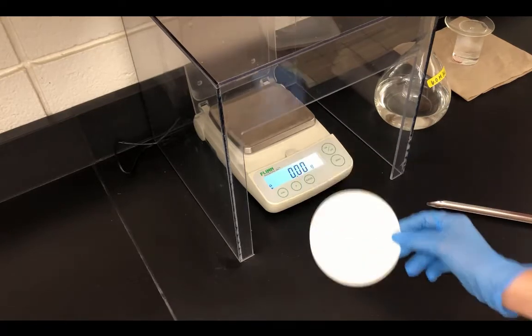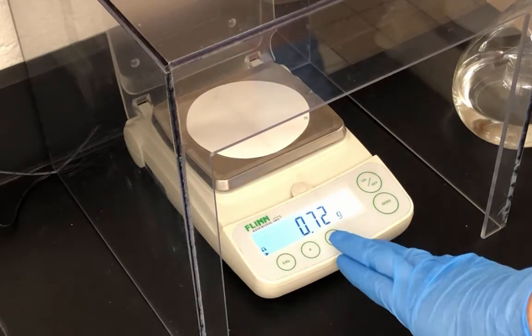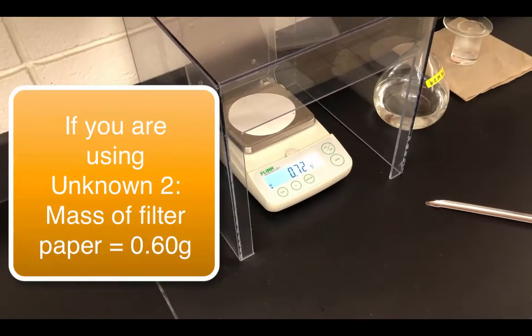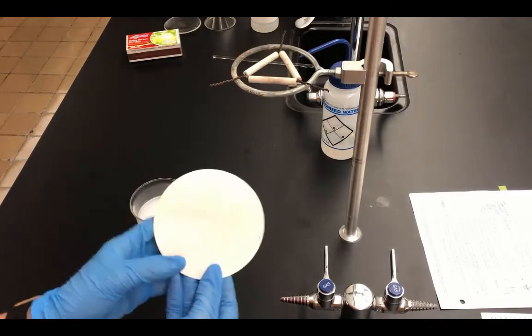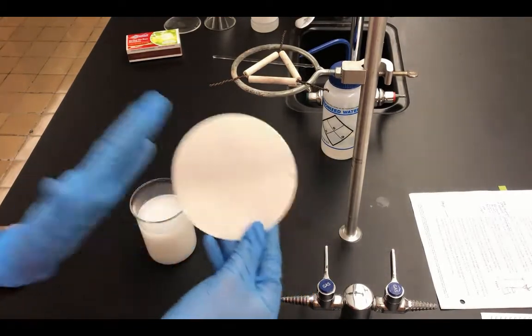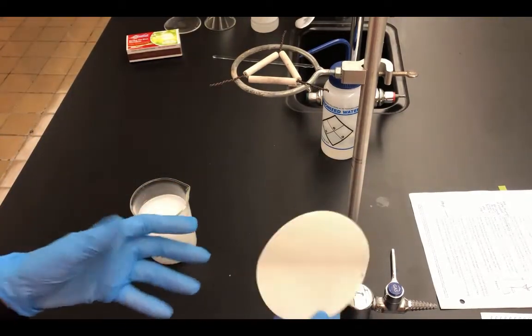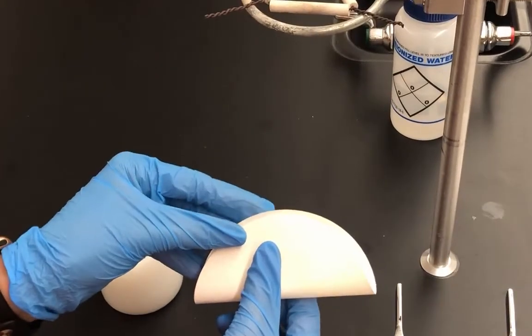Once you have your initials on it, go ahead and take the mass of the filter paper. The mass of this piece of filter paper is 0.72 grams. Make sure that you record that in your lab notebook. You always want to find the mass of the filter paper before you filter, and then find the mass again after. Once we have the filter paper with our initials on it, we're going to fold it.